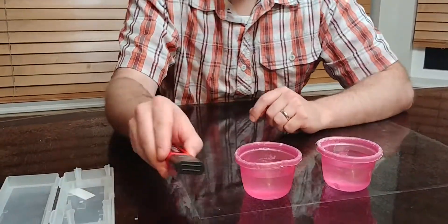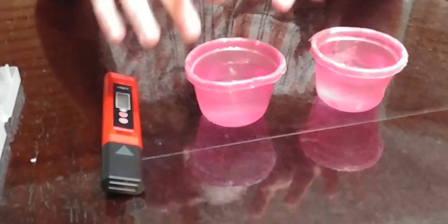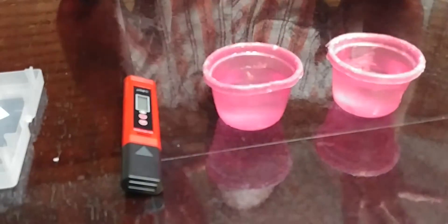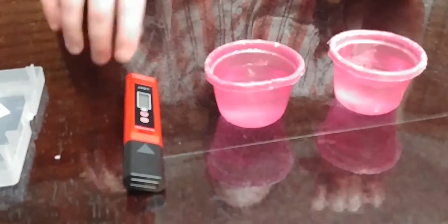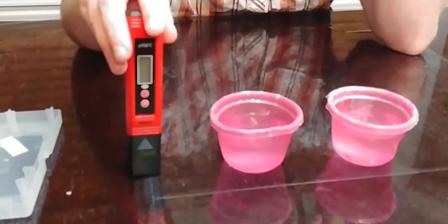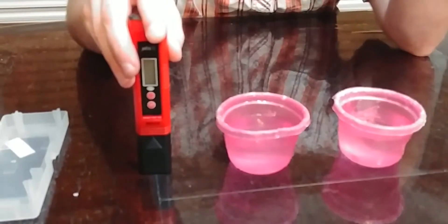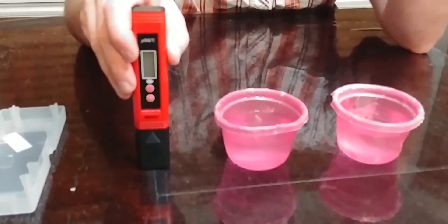The pen itself — it does not come with water but we're going to use some for testing. This one's water and this one's vinegar so we can get two different pH levels. You'd be able to use this for testing your water, your pool, water in a fish tank, or anything like that where you want to get the pH levels or temperature.